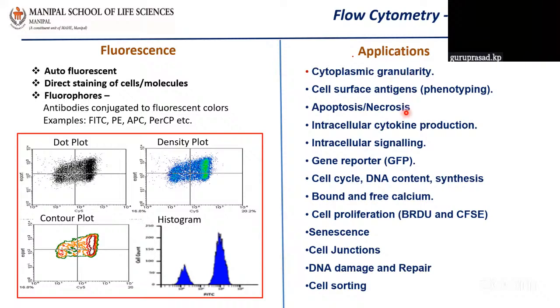So what are some applications? You can look at this, the right side. So you can look at the cytoplasmic granularity.